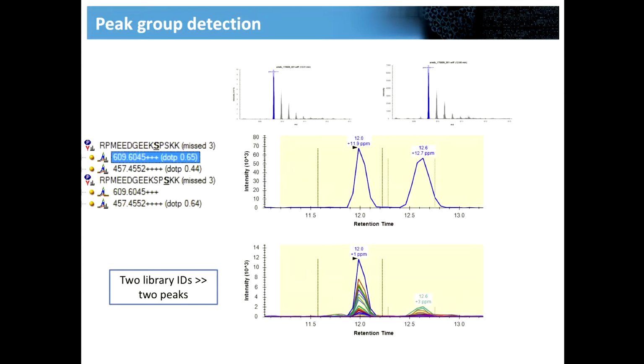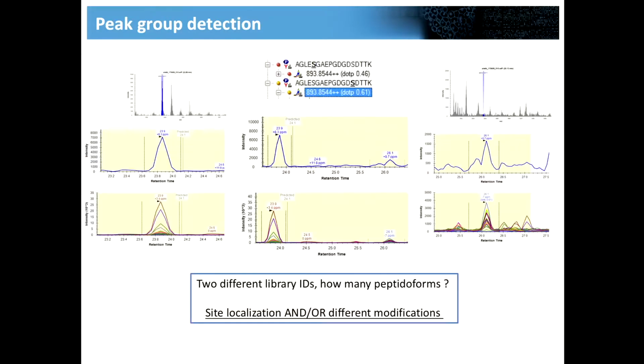So, can you go back? How do you explain, it looks like there's something coeluting over every one of them, but the MS1 extracted chromatogram always looks less intense than the fragment ions. Those are all tens of thousands for fragment ions and only thousands for precursors. How do you explain that?